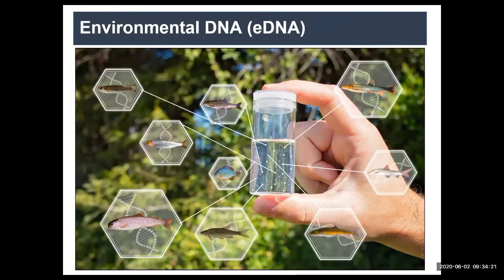All right, down to the meat and potatoes. So environmental DNA, what is it? It is any form of DNA, such as hair, skin, mucus, scales, that is shed into the media like a water column. And so this picture really explains it great because within that tiny little vial, you can see hundreds of different species with their DNA in there. Now, that relates more to a biodiversity project. And what we wanted to do, since we're dealing with the smalltooth sawfish, they are critically endangered, and so we wanted a species-specific project. And that's why we chose to use the most sensitive technology on the market, which is the Droplet Digital PCR machine. Next slide, please.